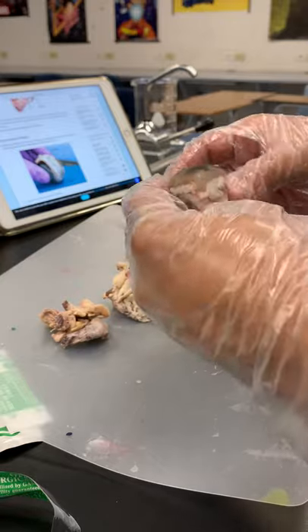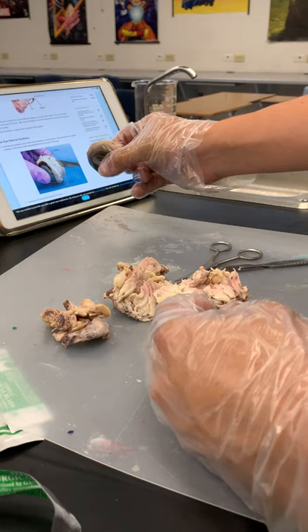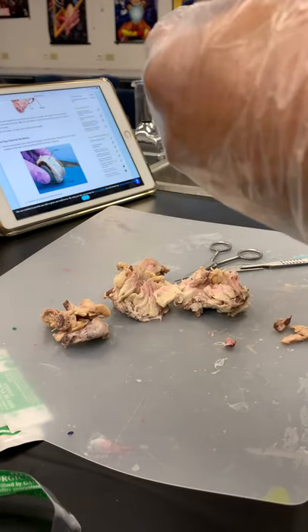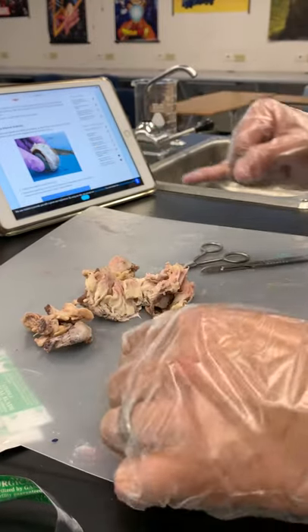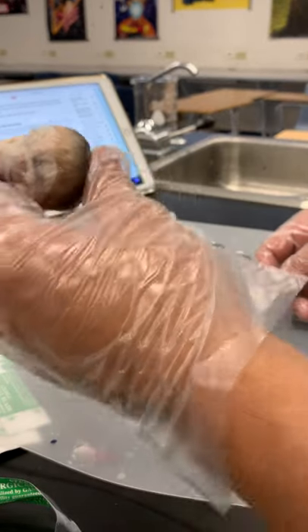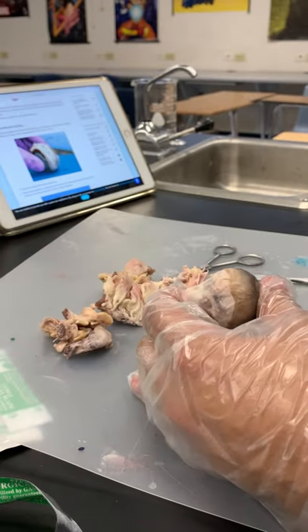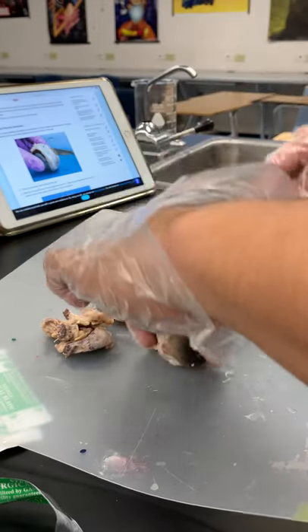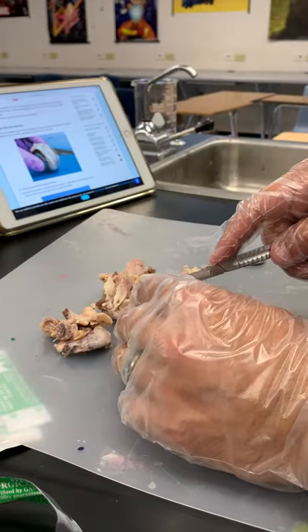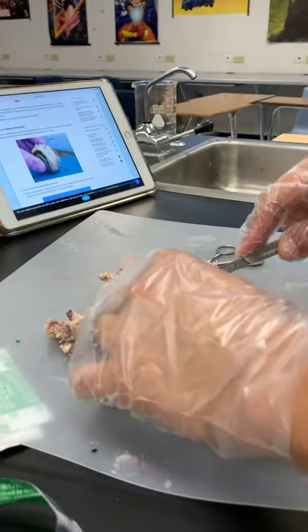Pretty close, kind of similar. You got a little bit more muscle, but right — so now we're going to split it in half. Kind of hold it in between — it's like a little tomato, kind of like a mushroom. We're going to split it literally in half. A lot of liquid coming out.